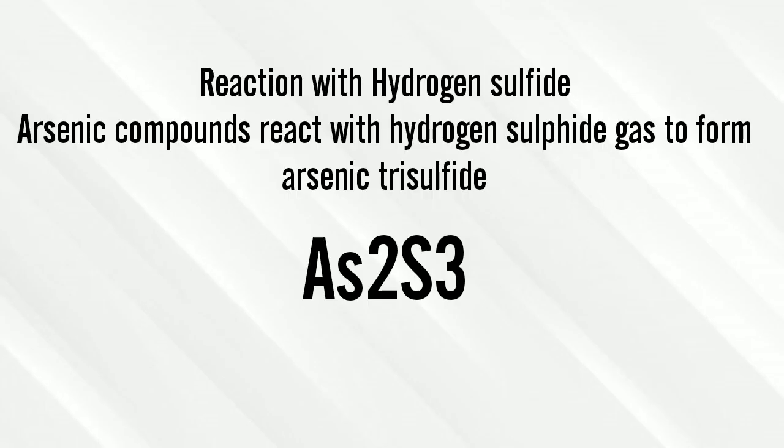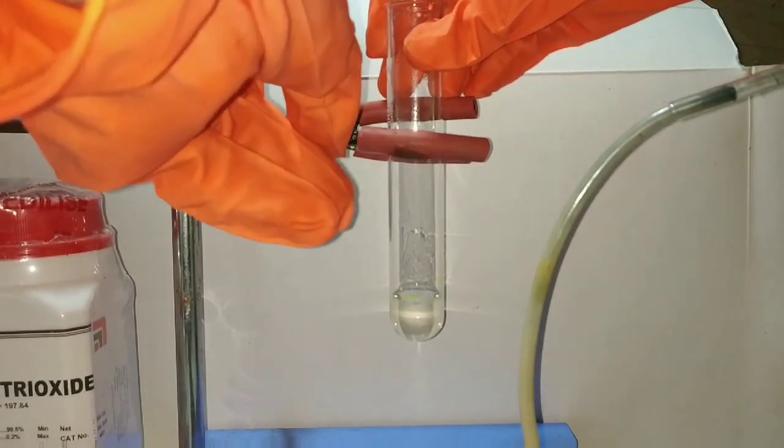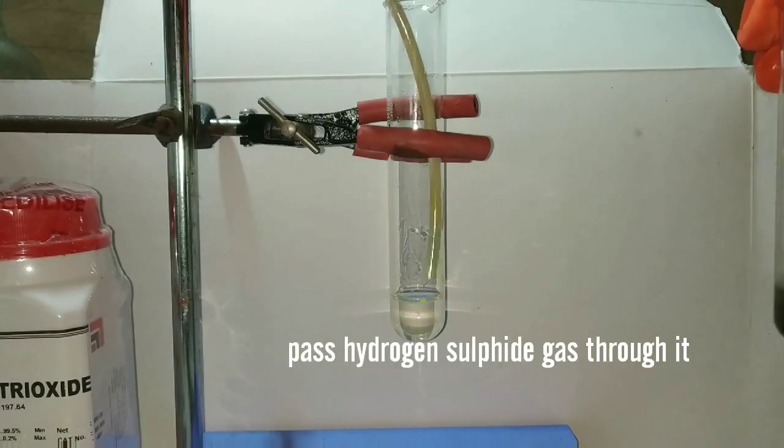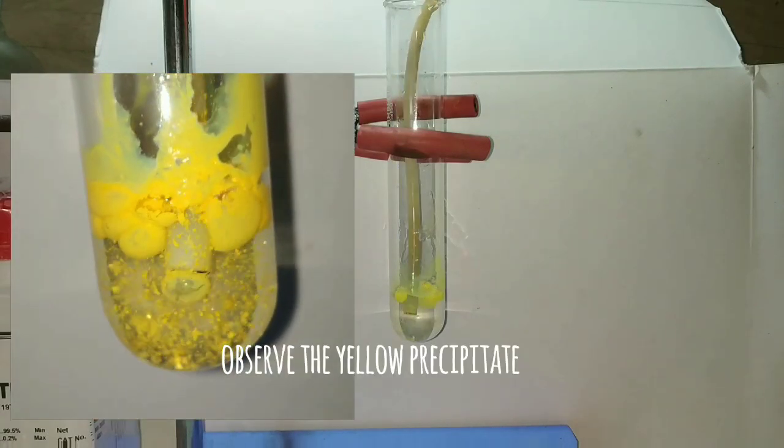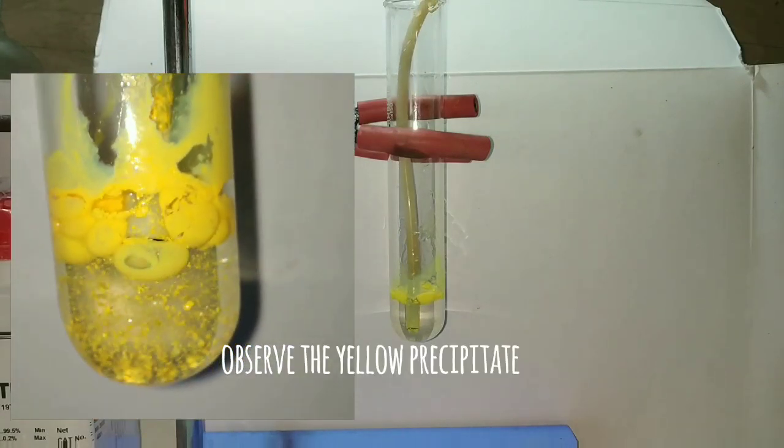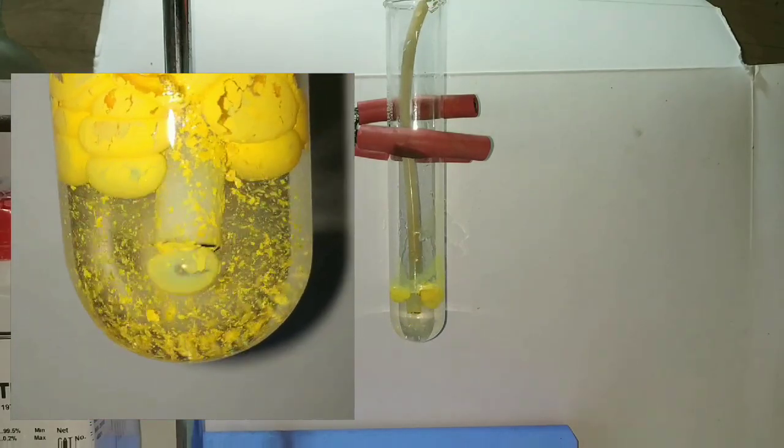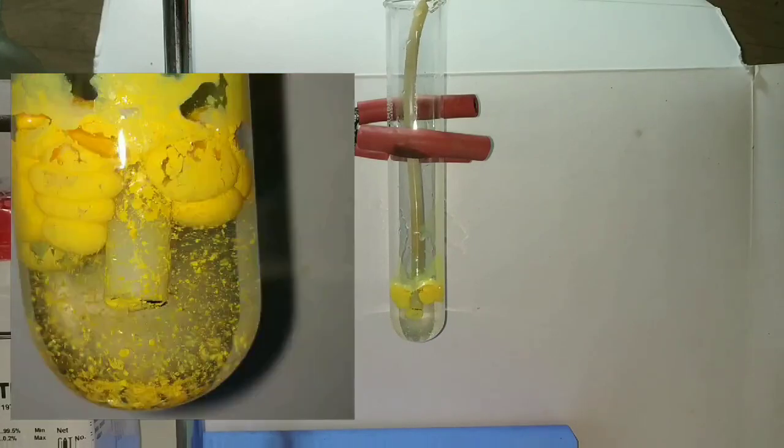Now we see the reaction of hydrogen sulfide with arsenic compounds forming arsenic trisulfide, a beautiful yellow precipitate. Here we are taking the arsenic trichloride prepared earlier. Now we will be passing hydrogen sulfide gas through it. You can see that on passing the gas there is formation of a beautiful yellow precipitate and this precipitate is arsenic trisulfide. And this is used as a test for analysis of arsenic ions in the laboratory.